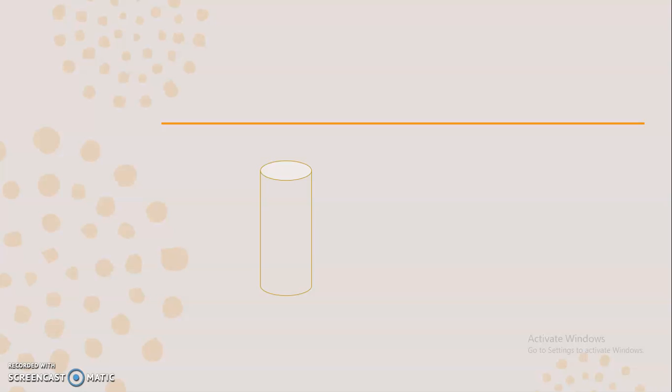If light falls on the surface of this sample solution, part of the light will be reflected, and part of the light will be transmitted. The light that is not absorbed and not reflected will pass as such through our sample solution.